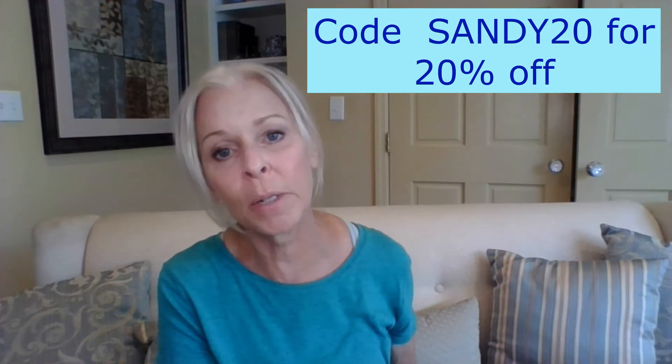The other thing that made me want to bring a review is that it is the cup form — it's not the soft foldable respirator. Some people just really like this harder domed cup design. These sell for $39.95 for a box of 10, so that's $3.90 per item. Armbrust does have a code Sandy20 — that's not an affiliate link, no commission for me. I don't want the room for bias that commission creates. I just leverage whatever influence I have to give a discount to my viewers. So that is good for 20% off: Sandy20.